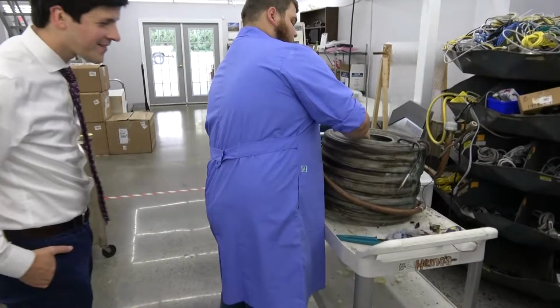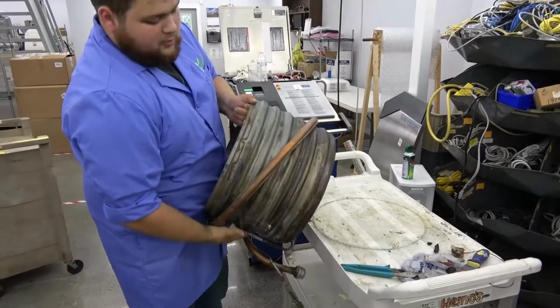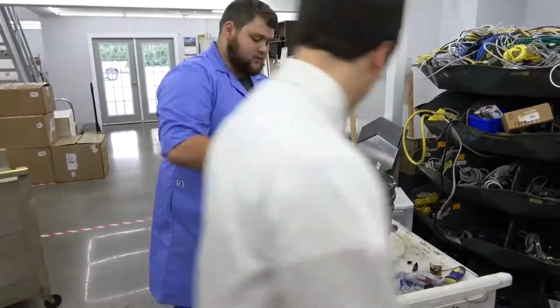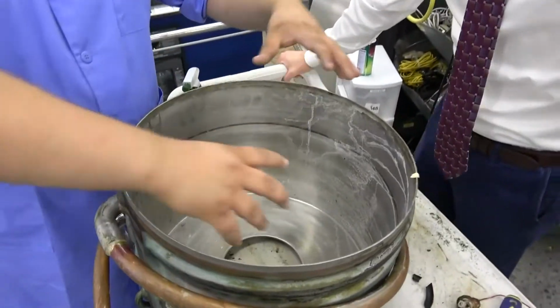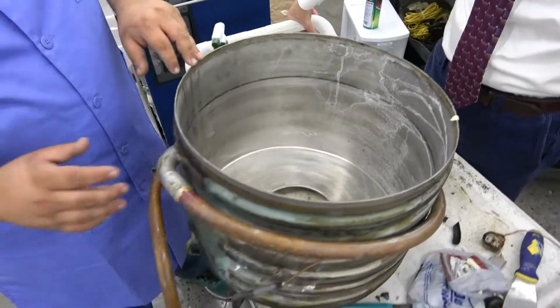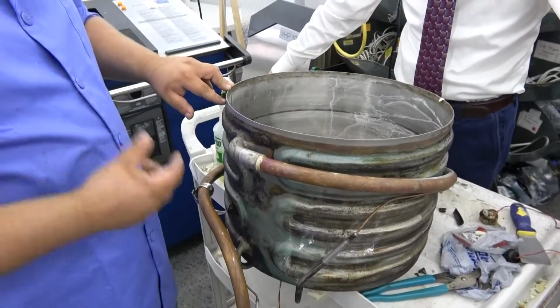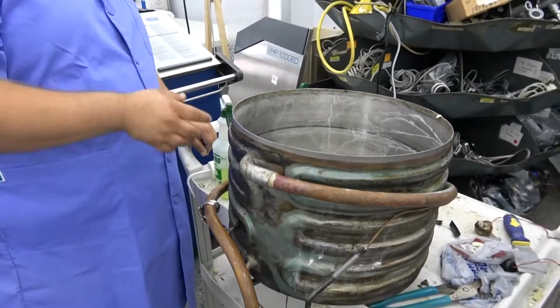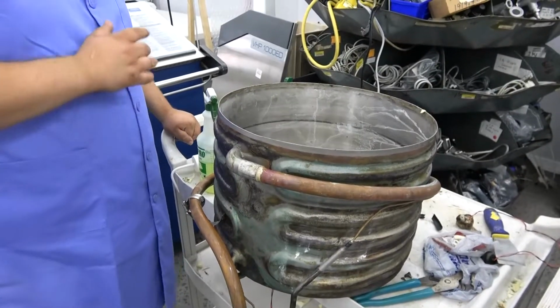So when you open the lid of the centrifuge, you slide your lid across, and your motor is going to come up through the top here, and you set your rotor on top there. And we were having a refrigeration issue with these lines. They kind of come unattached a little bit, and they leak the freon. And that's what was causing the corrosion on the things we got re-powder coated.